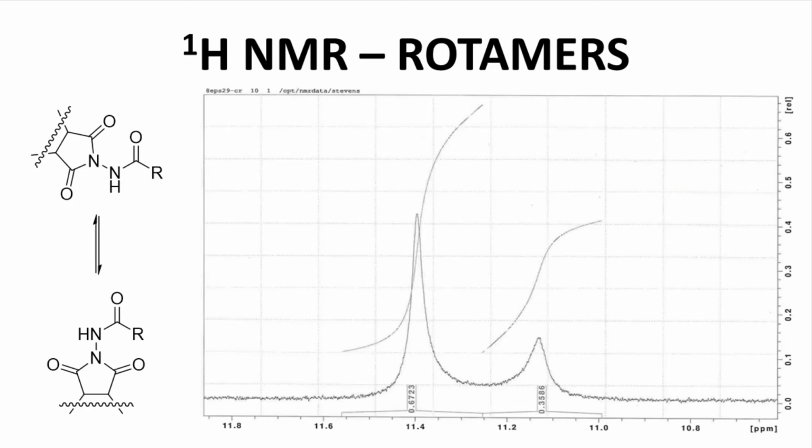Yes, we can distinguish the different NH signals, but the CH signals of the rotamers, while different, mostly overlap in the rest of the spectrum. That leads to rounding of the CH signals throughout the spectrum, and they end up looking like broad lumps. That's the reason I believe the other signals in the NMR do not show clear multiplicity patterns. That's enough about rotamers. Hopefully, after looking at the TLC, melting point, and NMR spectra, you feel comfortable that the compound is of high purity and the correct structure.